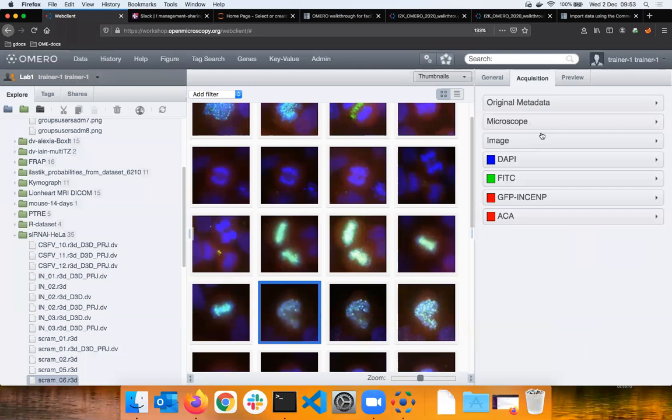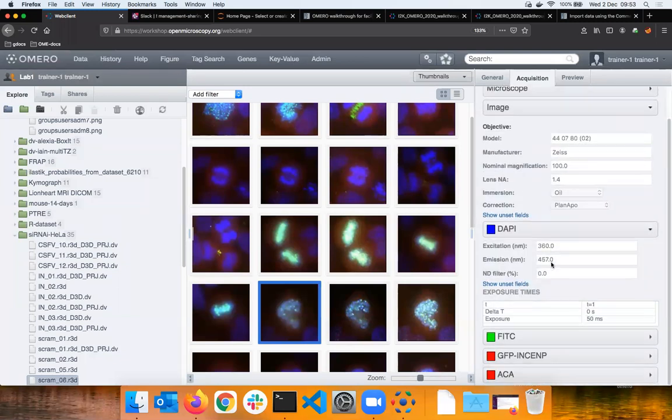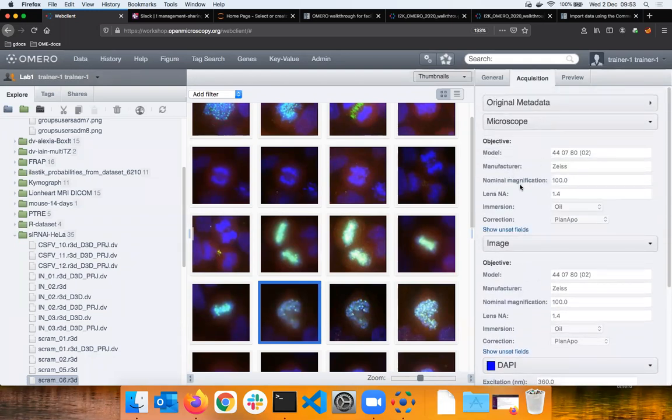And if we find in the original metadata some value which looks like a numerical aperture of an objective, we will take it over, put it into the relational database, and then display it in these harmonica tabs here in a more user-friendly manner. So you can see under microscope, it's much more benign. Immersion is here. The numerical aperture is here as well, as mentioned.